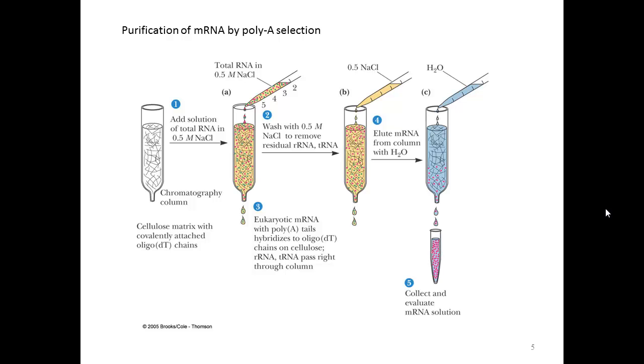In order to study mRNA, we need to isolate it and purify it, and this slide is an overview of that process. Remember that messenger RNAs have at their 3' end a poly-A tail. That's about 200 repeated bases of A at the end of the sequence. So using hybridization, we can hybridize that to a sequence of TTTTTTT, generally referred to as oligo-dT. And this will be the principle for the interaction, which is going to selectively retain the messenger RNA.